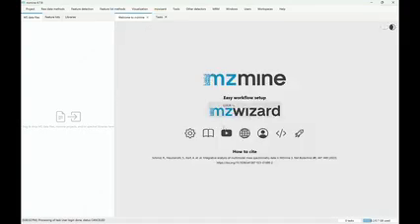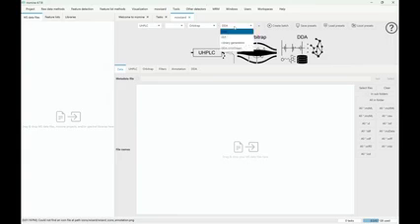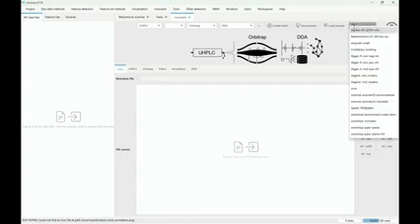So from here, we want to start the processing, and this is done in the mzwizard. With the mzwizard, this is our way of really streamlining how you build up the workflow like you do in your lab. We're going to put together a UHPLC method, there's no IMS involved. This time we're going to use an Orbitrap mass analyzer, but that doesn't matter so much. It's only different presets. And then we have data-dependent acquisition, where we have MS2 spectra for the top 5 precursors. And I am going to load a local preset.